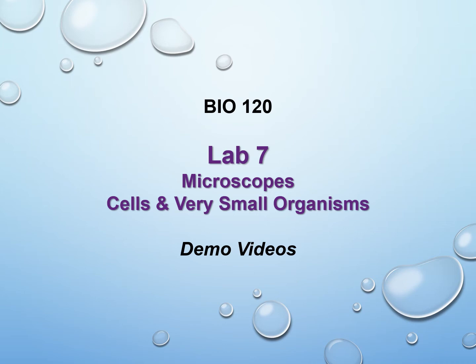In this lab, you will use the microscope to observe eukaryotic and prokaryotic cells, as well as several unicellular and multicellular organisms. Before you can do that, though, you need to become familiar with how to set up a microscope, the main components of the microscope and how to use them, as well as how to determine the size of the field that you're viewing so that you can actually estimate the sizes of the cells or the organisms that you're observing under the microscope.